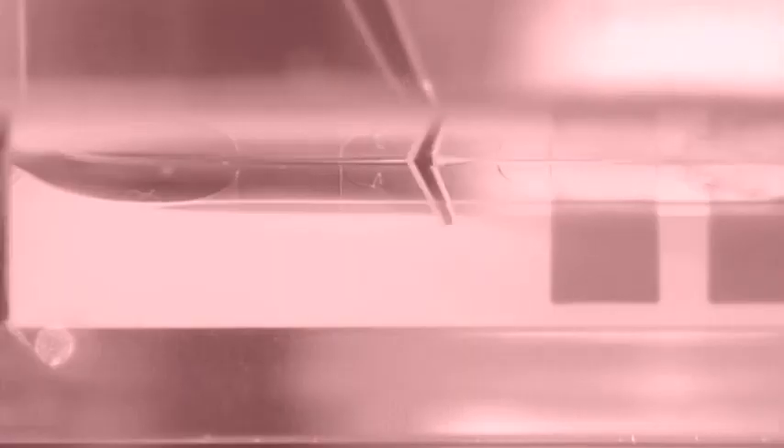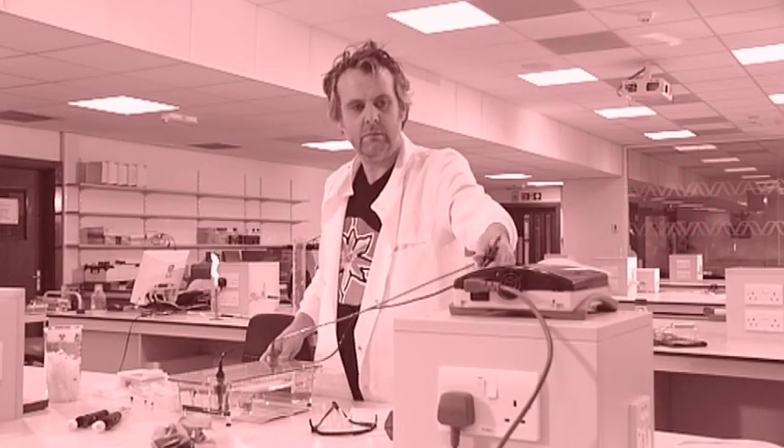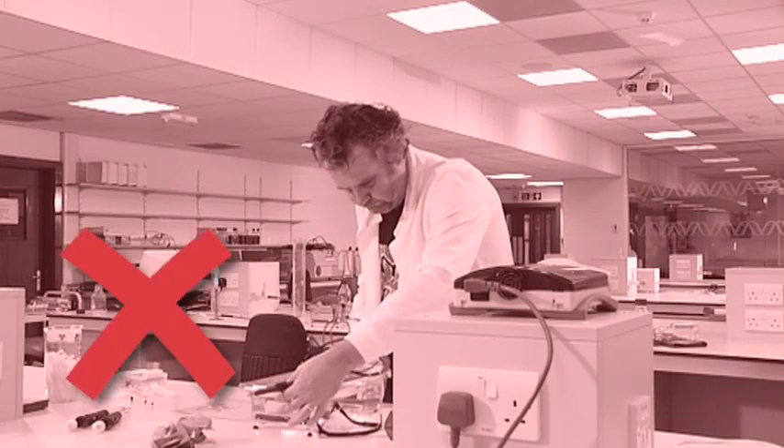Take care not to damage the wells when loading your samples. A damaged well can allow the sample to leak out and may cause contamination of other wells. It can also cause nucleic acid fragments to migrate unevenly. Make sure you don't load air into the wells along with your samples — air can cause samples to be lost from the well into the buffer solution and can also cause contamination of neighbouring wells. Another mistake that can be made when loading a gel is to load the sample too quickly, which will also cause the sample to flow out of the well. Once you've loaded your samples, take care not to move the gel, as even a small movement can cause sample loss and contamination.